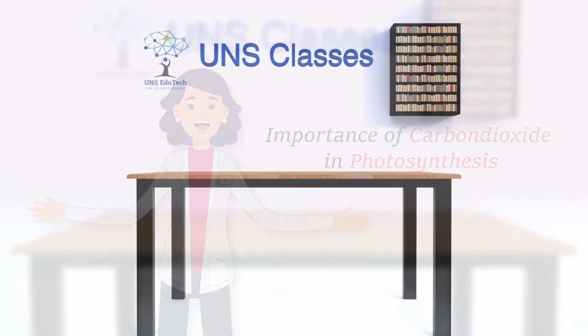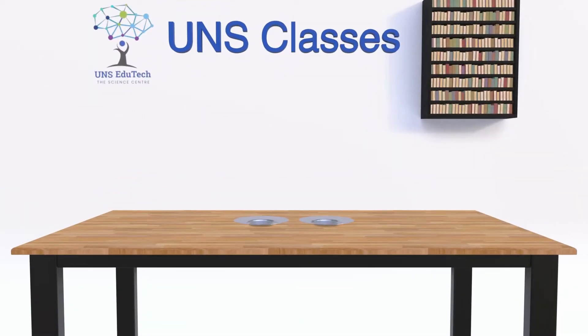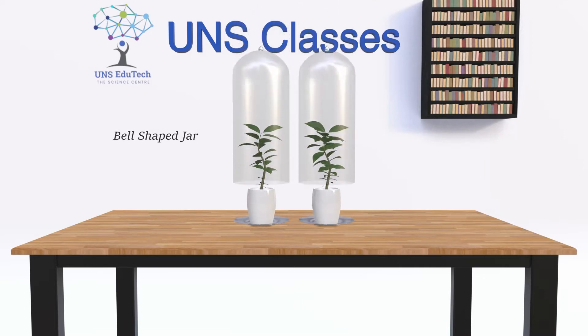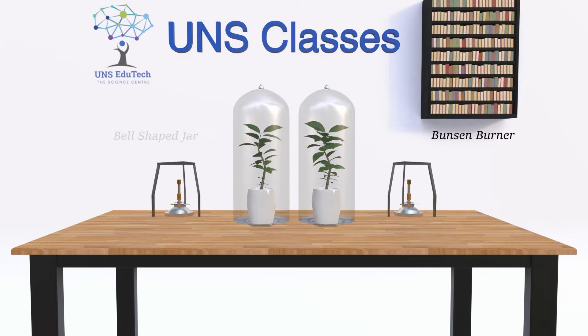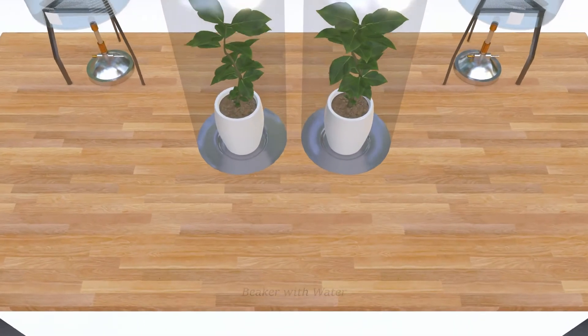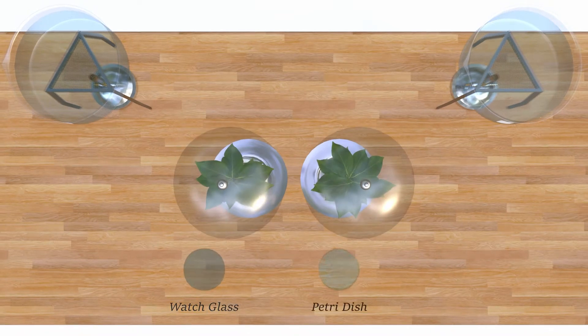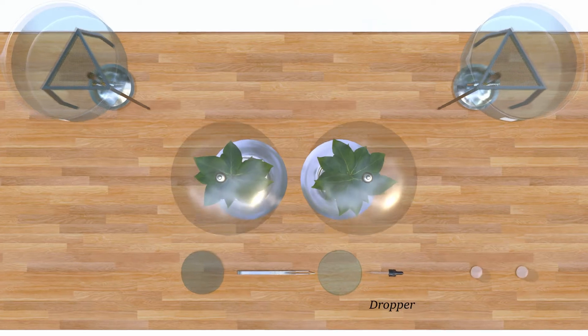For that we require two glass plates, two healthy potted plants of same size, two bell-shaped jars, Bunsen burner with stand, two wide open beakers with water, two watch glasses, four subs, ethyl alcohol, potassium hydroxide, iodine, and petroleum jelly.